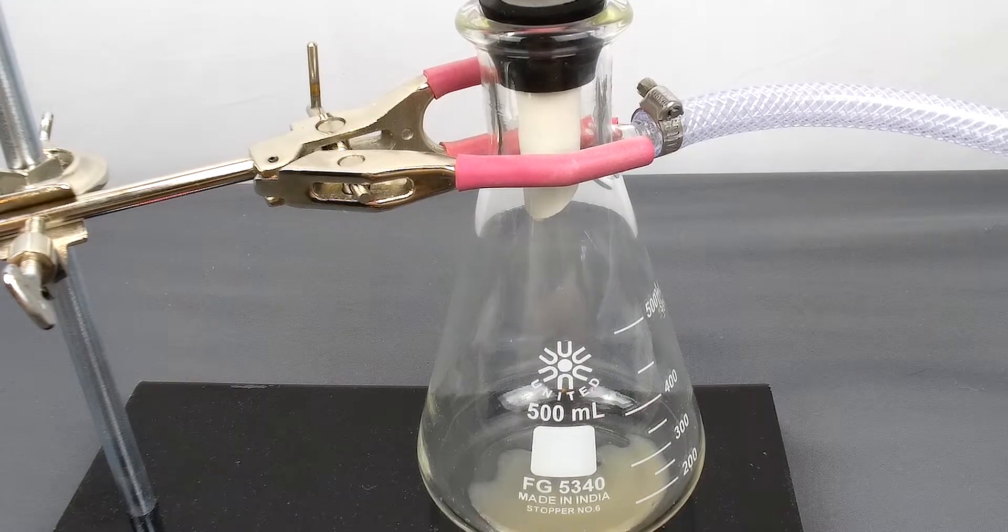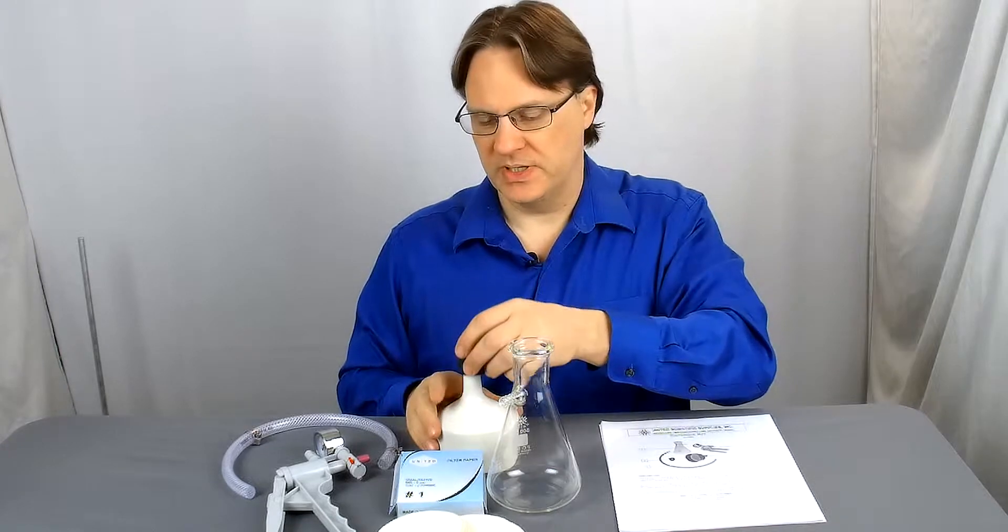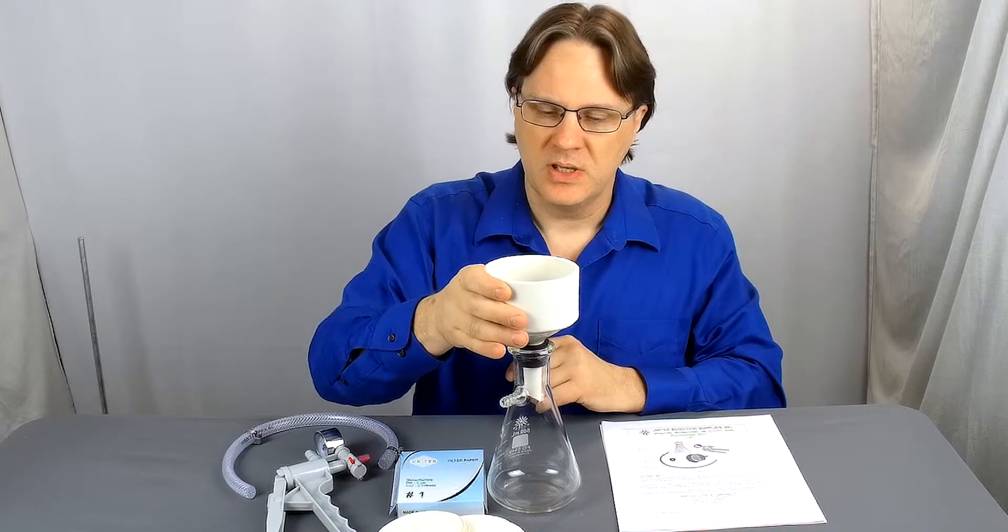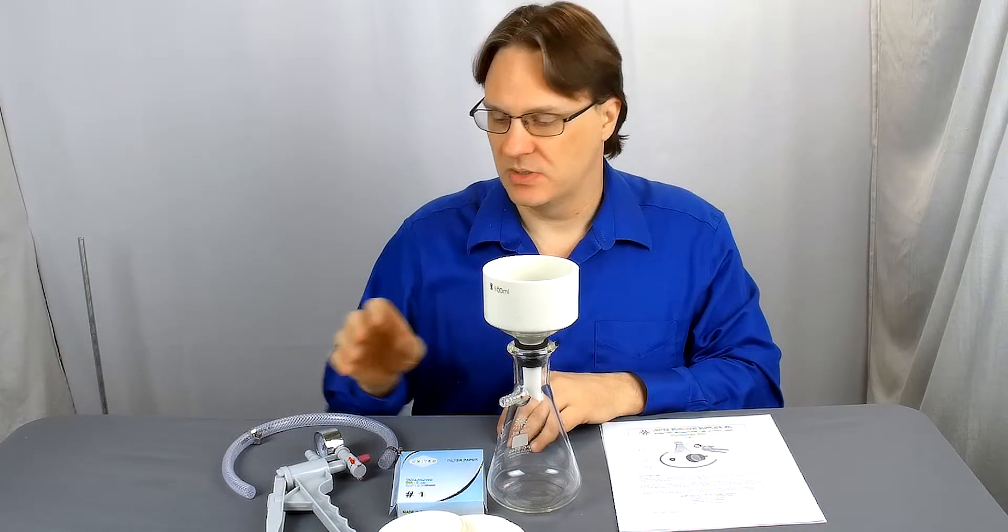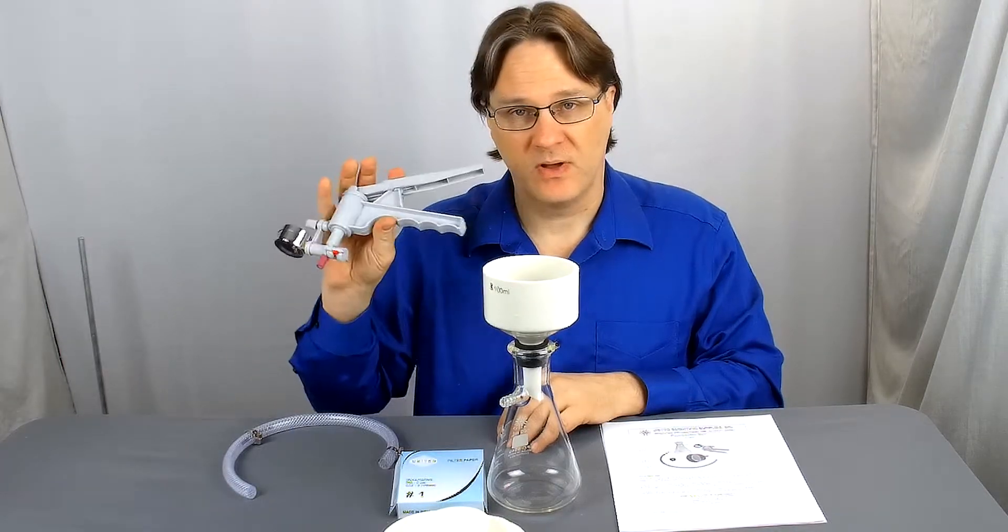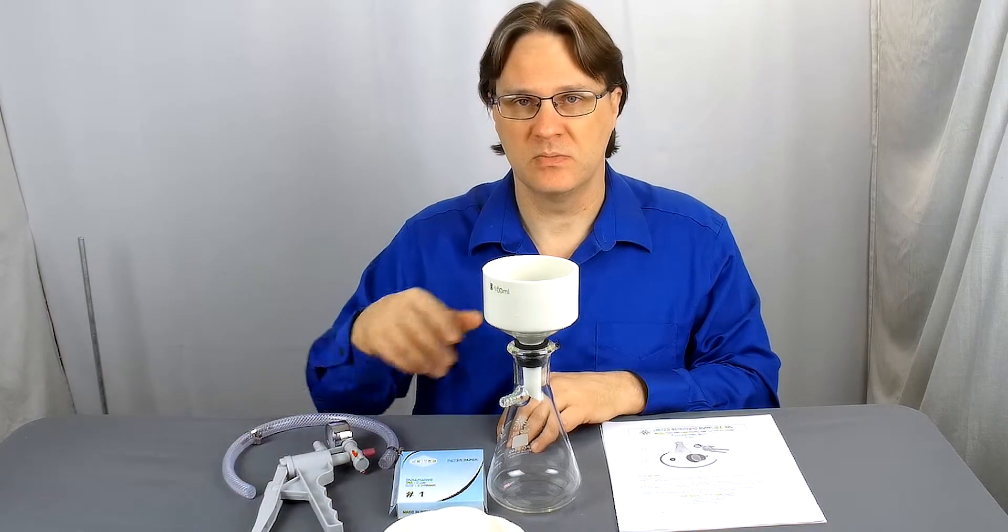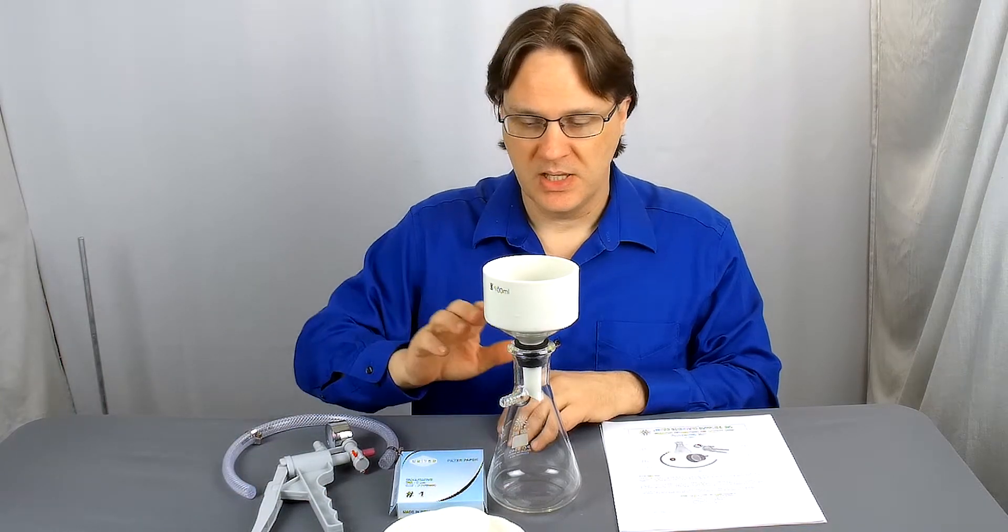The vacuum filtering kit has many advantages over the gravity-fed versions of filtration. It makes the process go much faster, and you can have the students get involved by using either the hand pump or you can connect it to your own vacuum system that you have in your lab.